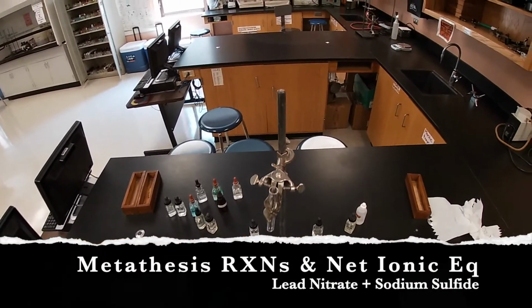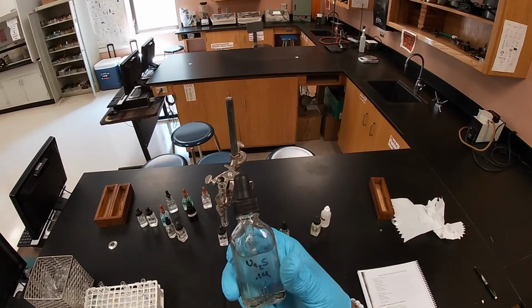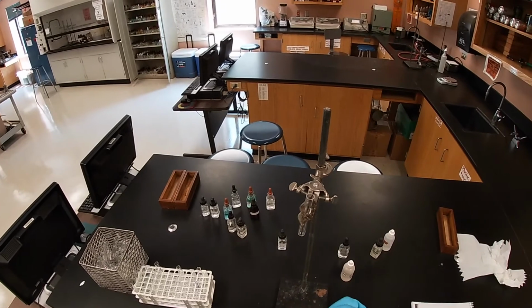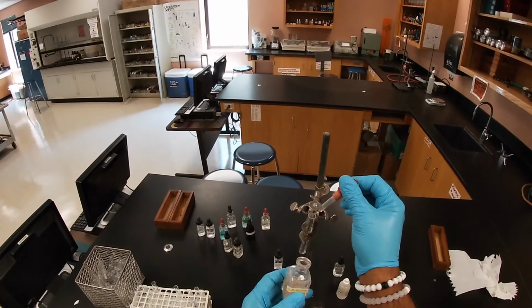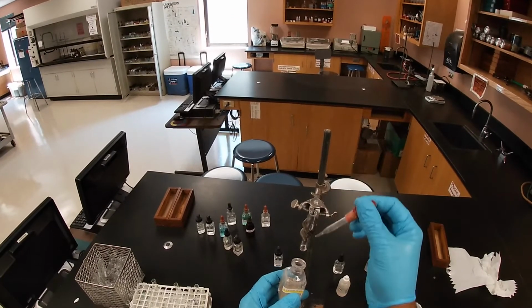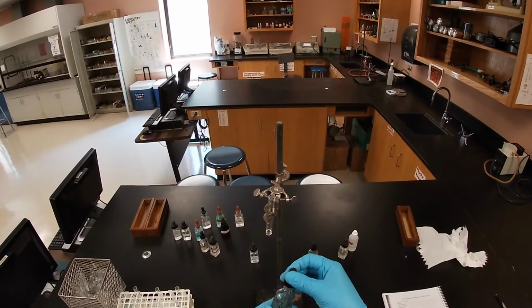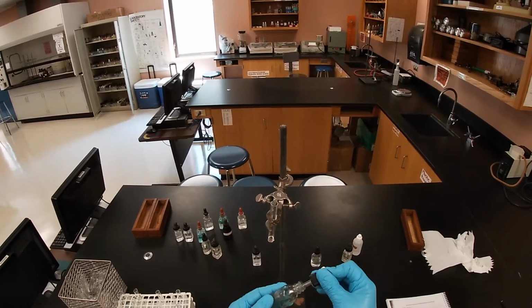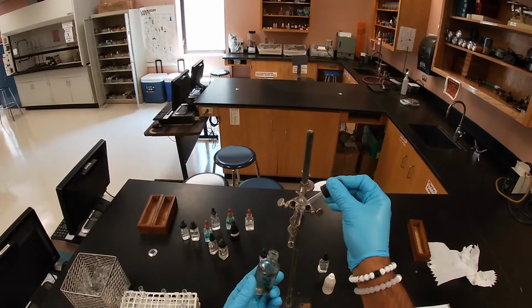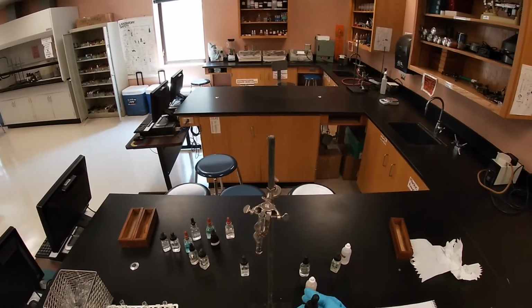Okay. For the following reaction, we're going to have lead nitrate, which is reaction 14, with sodium sulfide. And I can tell you that it still smells like rotten egg. So we're going to go ahead and add a dropper full of our lead nitrate into our test tube. And then we're going to add also a dropper full of our sodium sulfide. And I'll just add a few drops so that you can see the type of precipitate that was formed.